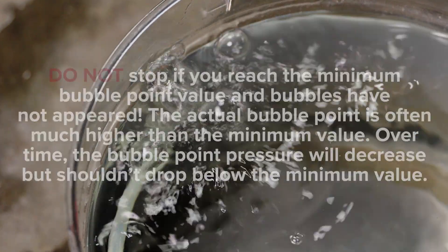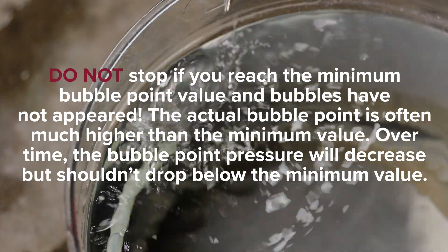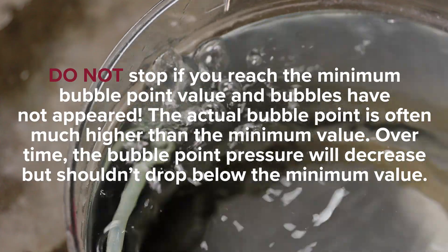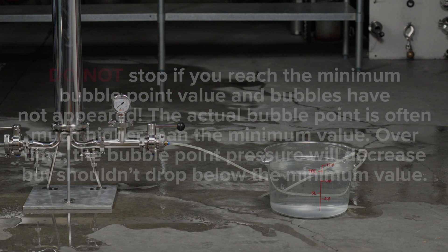Pro tip: do not stop if you reach the minimum bubble point value and bubbles have not appeared. The actual bubble point is often much higher than the minimum value. Over time, the bubble point pressure will decrease but should not drop below the minimum value.